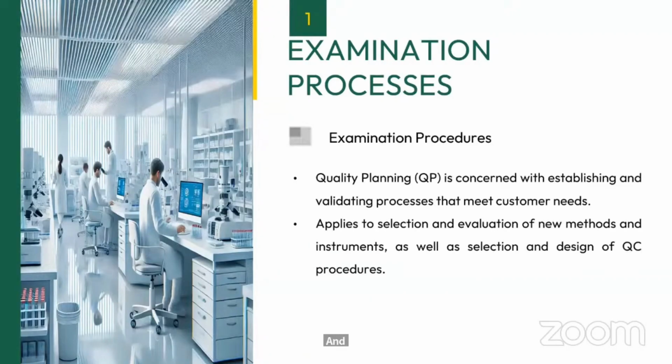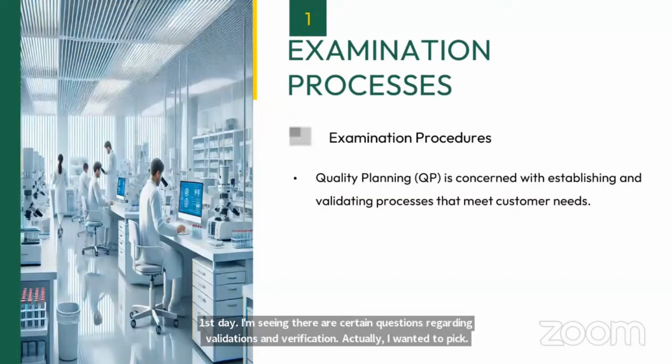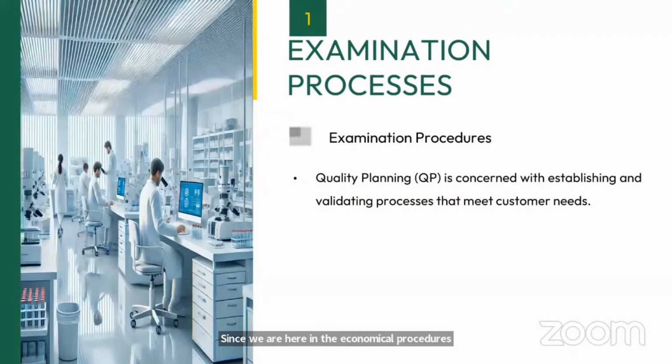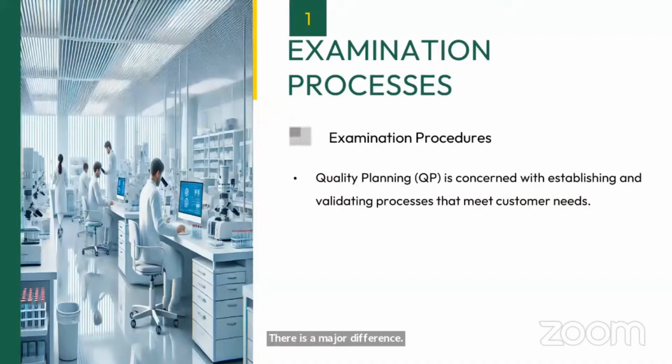Okay, so coming to the verification part, I think we can cover the validation of examination processes here, because since the first day I am seeing there are certain questions regarding validations and verifications. Since we are here in the examination procedures, we will take it now itself. Now there is a major difference: what is meant by validation of examination processes and what is meant by verification, and whether in the laboratory you want to do validations, verifications, or both.